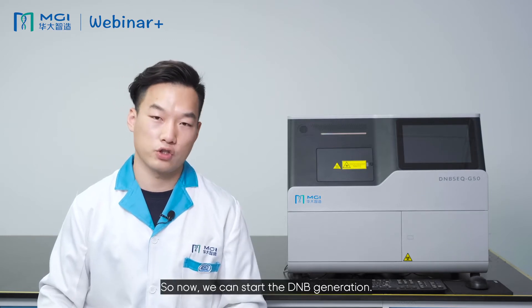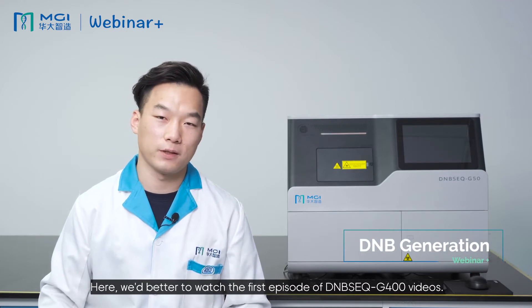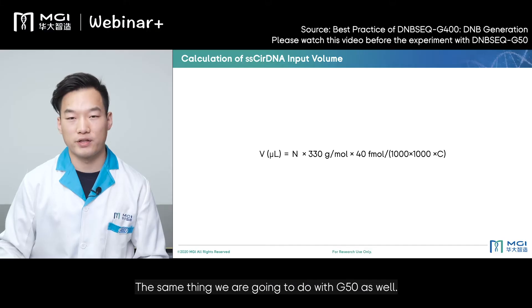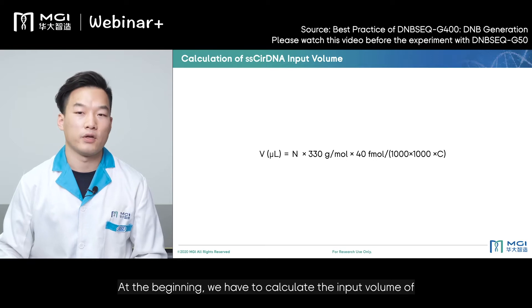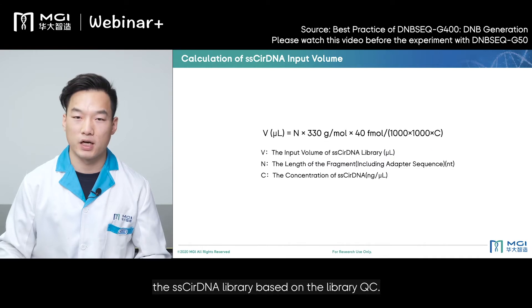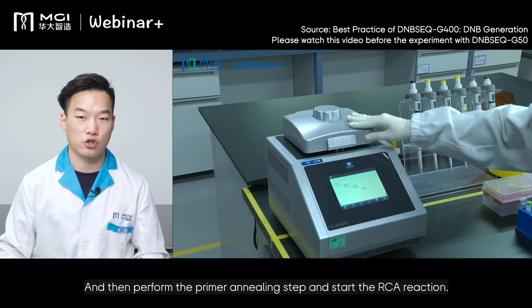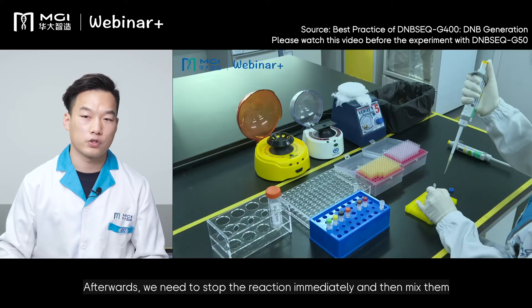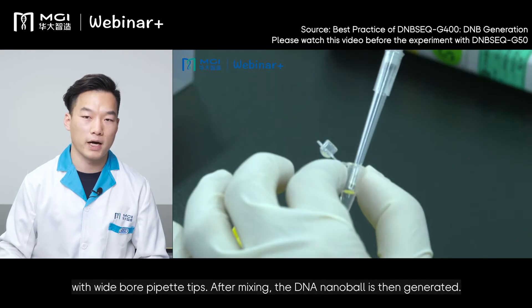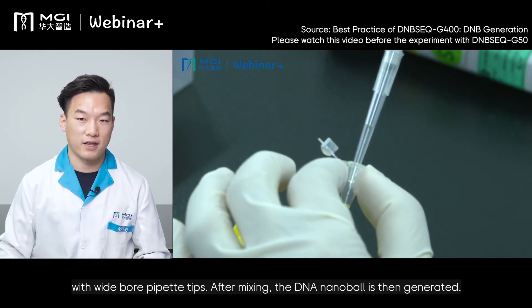Now we can start the DNB generation. It is recommended to watch the first episode of the DNBSEQ-G400 videos, as the same procedure applies to the G50 as well. At the beginning, we have to calculate the input volume of the single-stranded circular DNA library based on the library QC, then perform the primary annealing step and start the RCA reaction. Afterwards, we need to stop the reaction immediately and mix with wide-bore pipette tips. After mixing, the DNB is then generated.